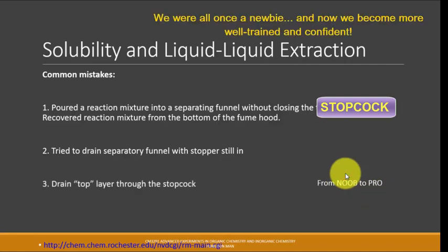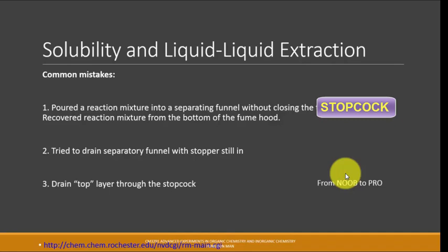And the last mistake they make is they drain the top layer through the stopcock. So remember, 2 layers: the bottom comes out from the bottom, the top comes out from the top. Don't mix them up. Don't do it just for convenience.